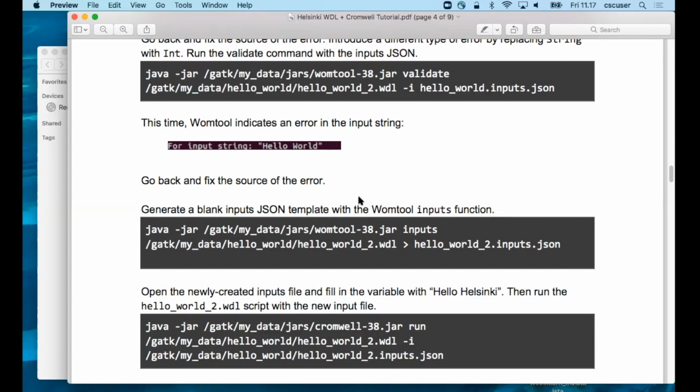So it creates a standard error file, and in the standard error file, it'll give you details of where the GATK error comes from. But even before that, I think the question is, how do I know how my command is interpreted, like there's a command with a whole bunch of variables in it?